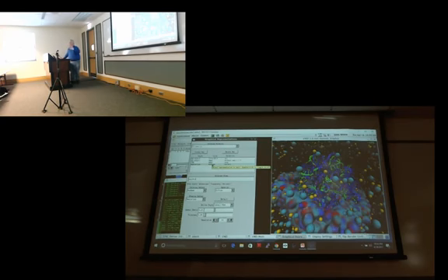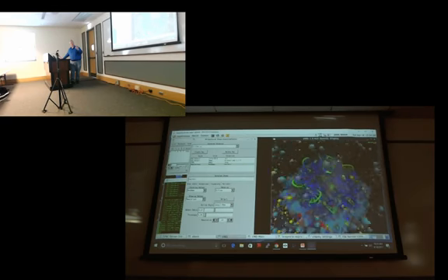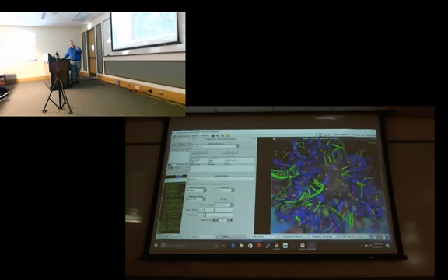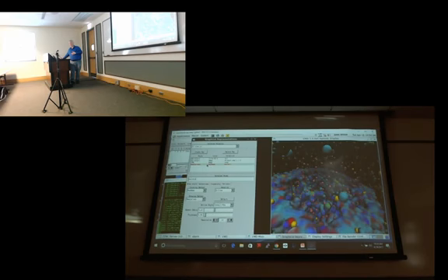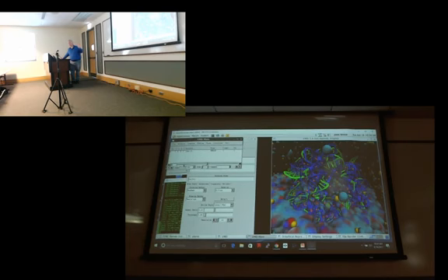So let's say you're in the middle of doing various things and you want to make a variety of figures. You want to show just the surface by itself, without, I want to show that virus capsid without the RNA in the interior. Even though I created that representation for the RNA, I can just hide it by double-clicking it. So you can see it turns red like that. That's very easy to do. I showed this to another group, and they were all like, "Oh, how did you do that?" Well, I just double-clicked.